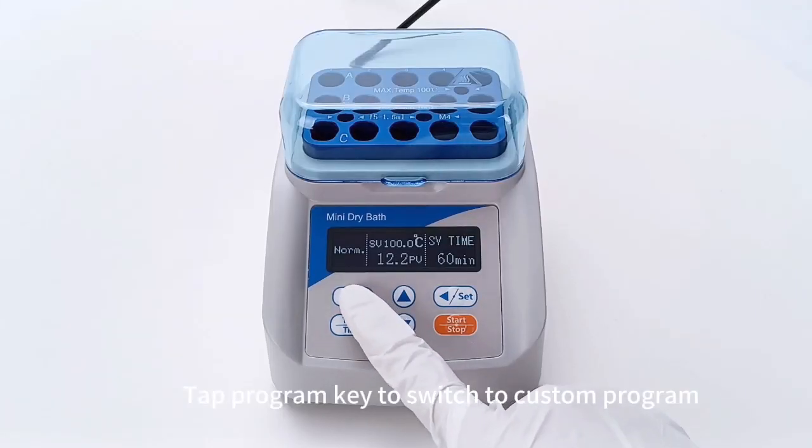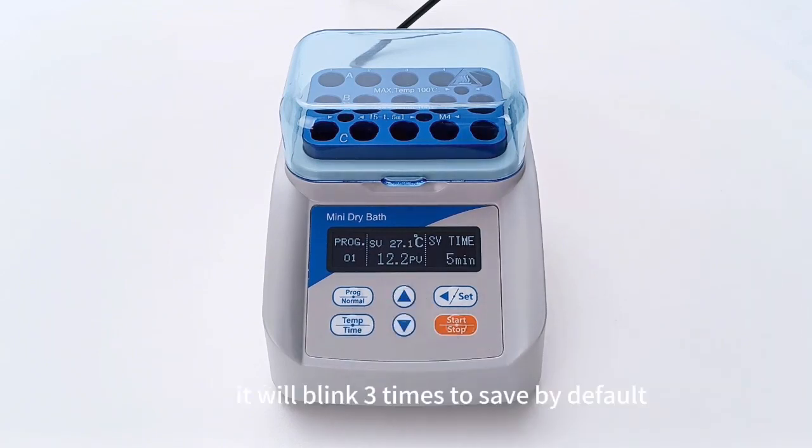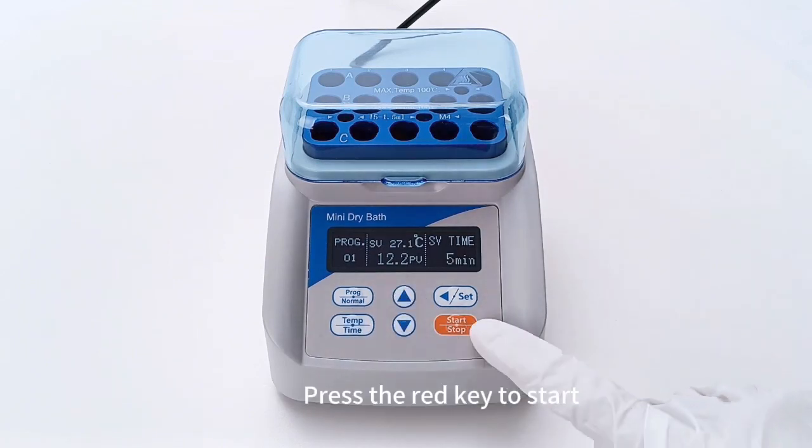Tap program key to switch to custom program. After adjusting the parameter value, it will blink 3 times to save by default. Press the red key to start.